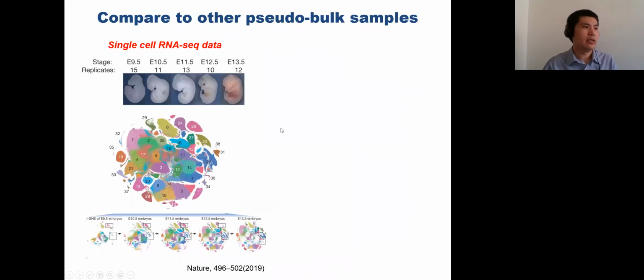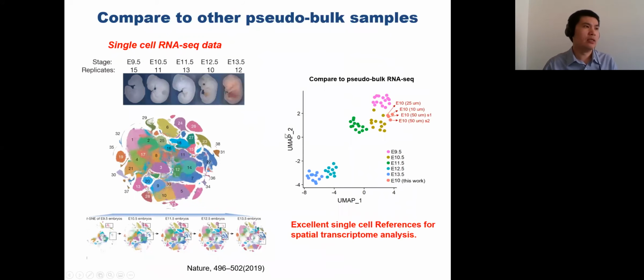Another thing I want to mention here is we want to compare our data with single cell data, because single cell data is based on single cells and seems cleaner, since our spots may contain more than one cell.